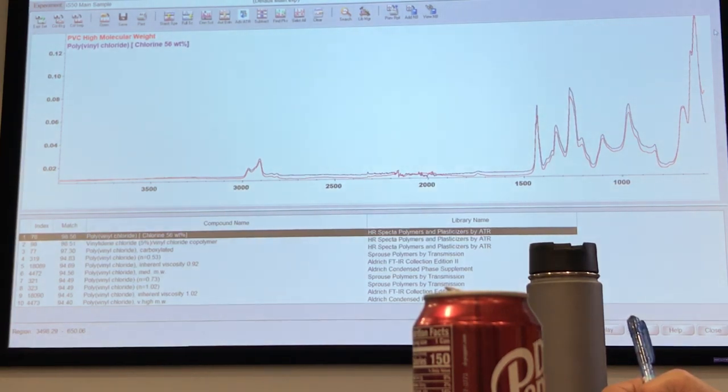In whichever way you are looking at it, if a particle is tilted like this, then the light may come back better scattered. It may be the same particle, but it may not have exactly the same amount of light coming back. And so the spectral difference can be pretty subtle. That's why, just like you mentioned, it's really important that we create a library just the way you want to measure it.